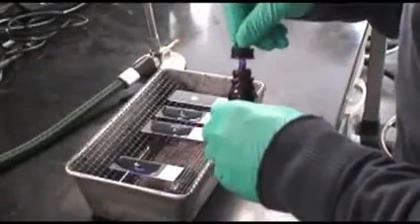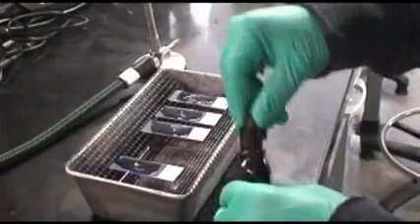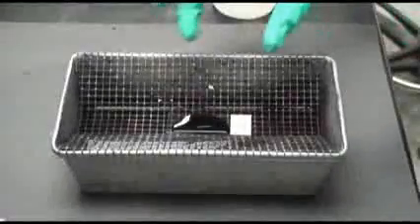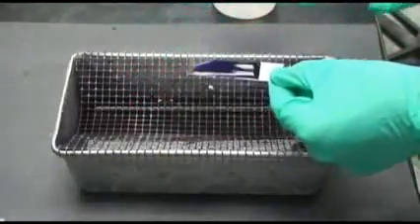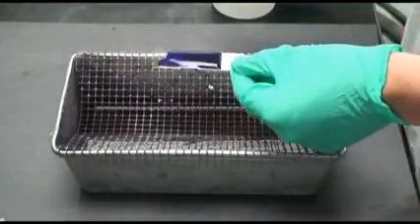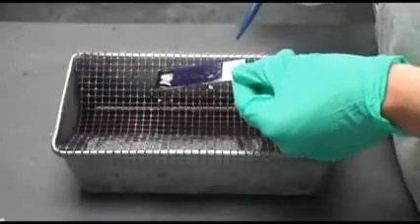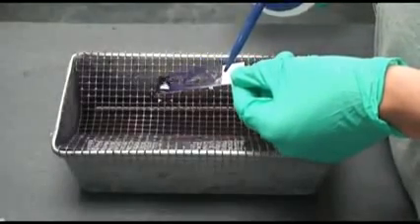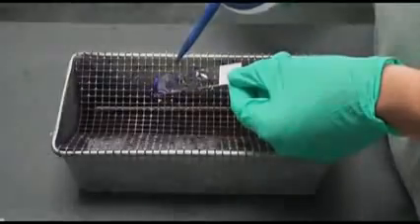The Gram stain consists of a series of stains. First, cover the smears with crystal violet for 30 seconds. Gentle rocking of the slides will facilitate proper coverage. Between each stain, the slide is to be rinsed with water. A gentle stream of water should be applied to the tilted slide, taking care not to spray directly onto the bacteria, as this may wash away the bacteria. It is not necessary to dry the slide until the entire Gram stain is complete. Make sure to repeat this washing process between each stain.